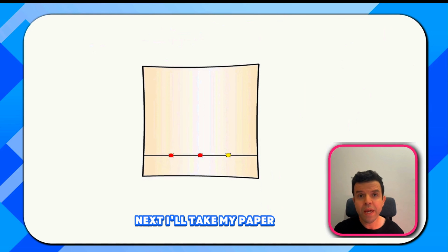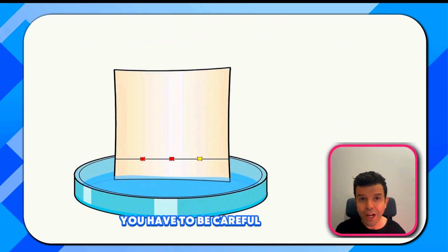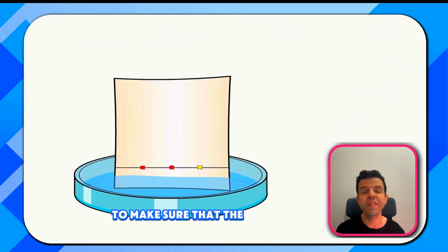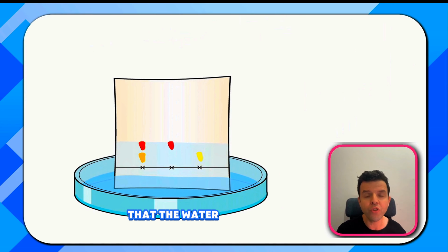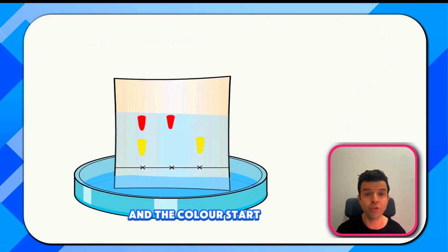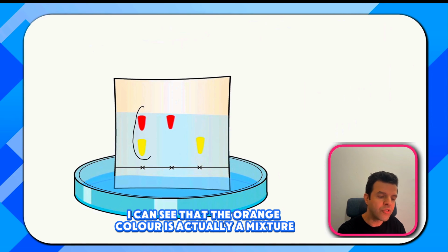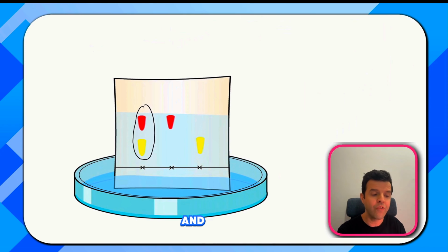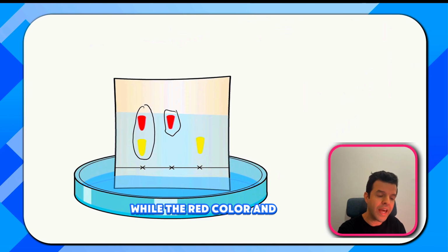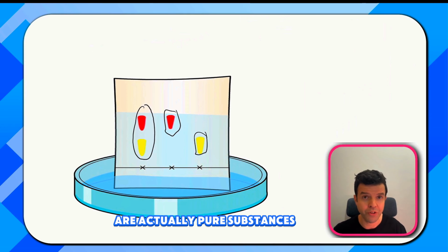Next, I'll take my paper and put it in a beaker where there's a solvent. You have to be careful here to make sure that the baseline is above the level of the solvent. And you can see here that the water starts to climb up that chromatography paper and the colors start to separate. From here, I can see that the orange color is actually a mixture of both yellow and red, while the red color and yellow color here on the right are actually pure substances.